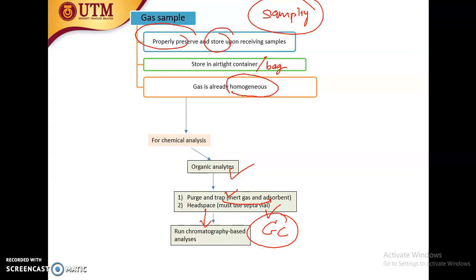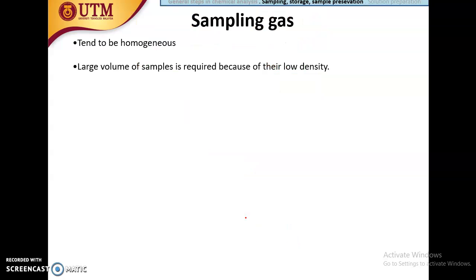Can we do HPLC? No, we cannot do HPLC. We can only do GC. Okay, let's go back to how we sample the gas.